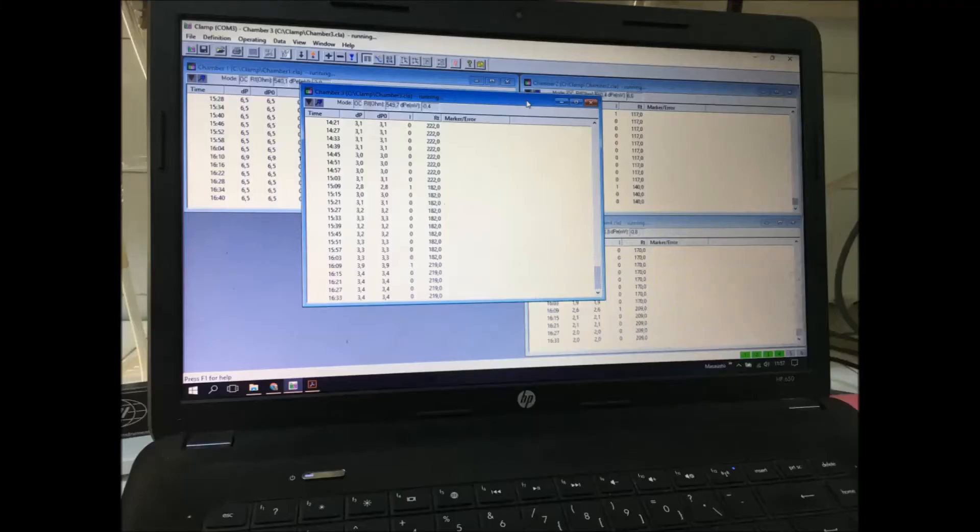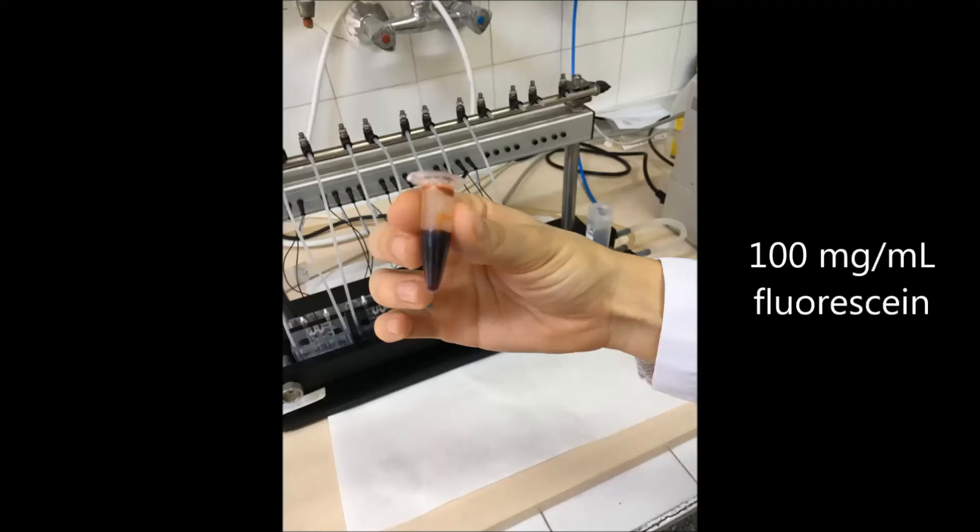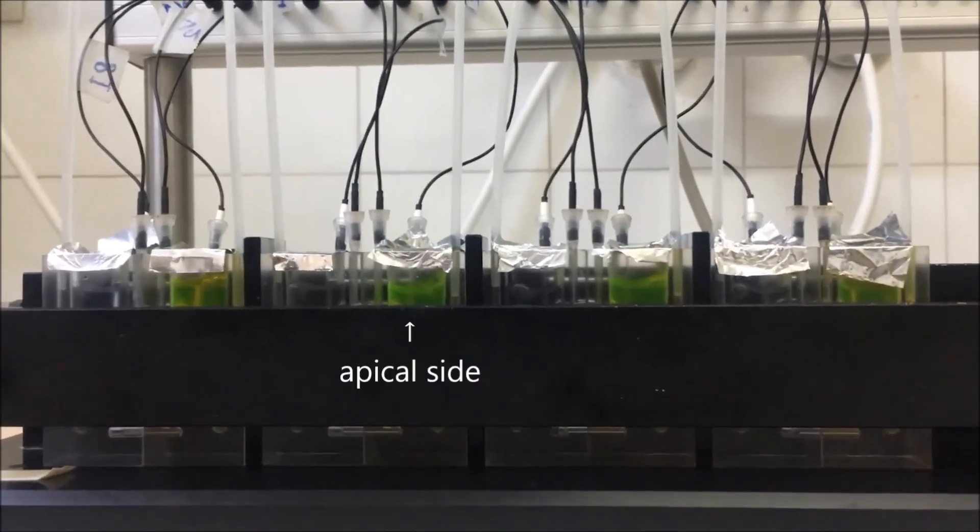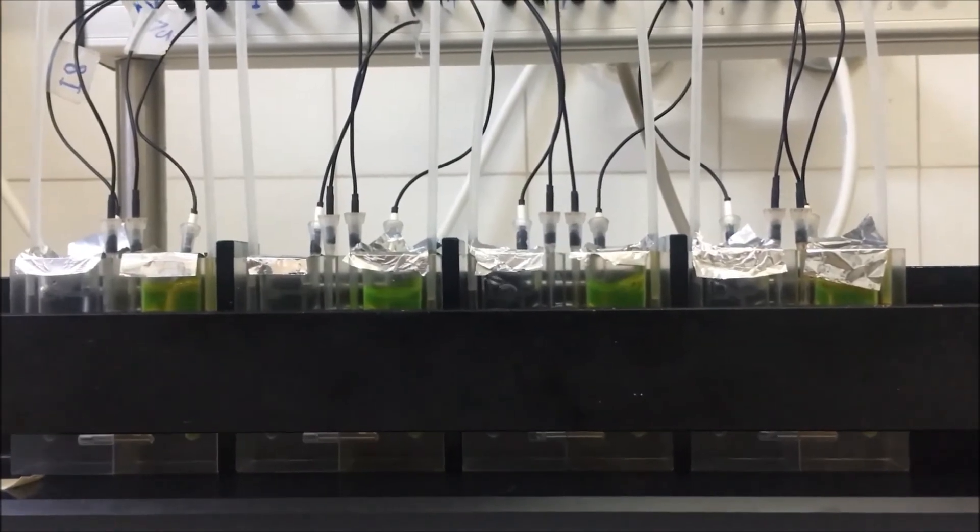The system automatically records the transepithelial resistance. A stock 100 mg per milliliter fluorescein should be prepared to measure epithelial permeability. 30 microliters of fluorescein is added to the apical side of each chamber 30 minutes after the mounting.